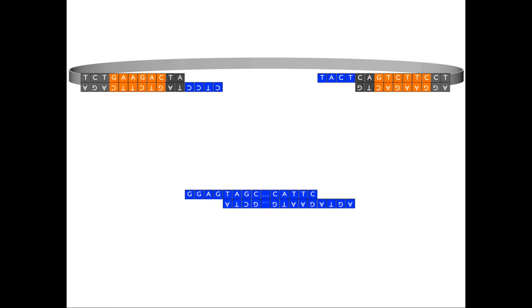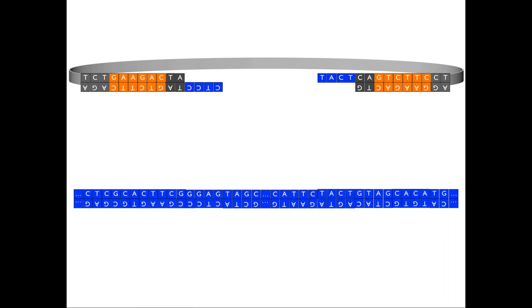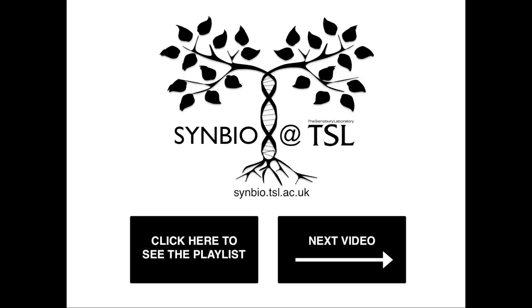It can be ligated to other fragments of DNA that have compatible ends, and, when the two pieces of DNA are joined together using a DNA ligase, no part of the restriction enzyme recognition sequences will be present.